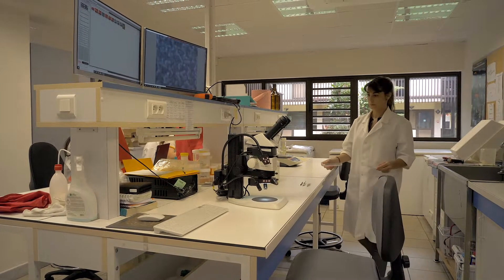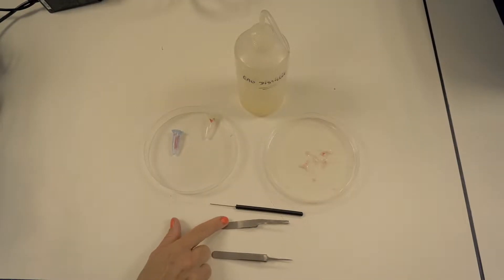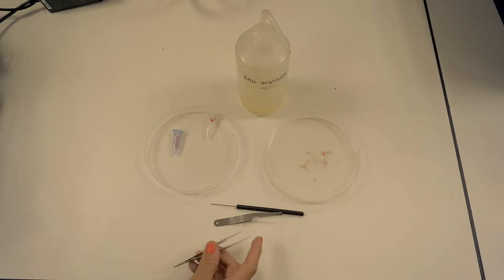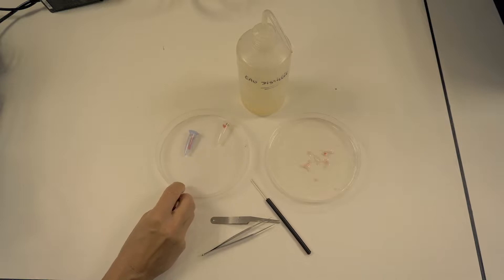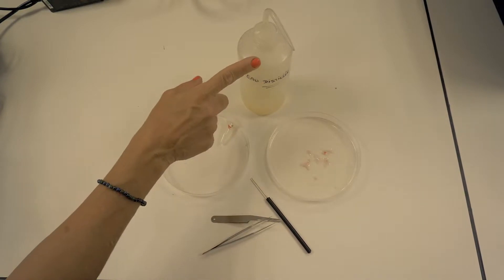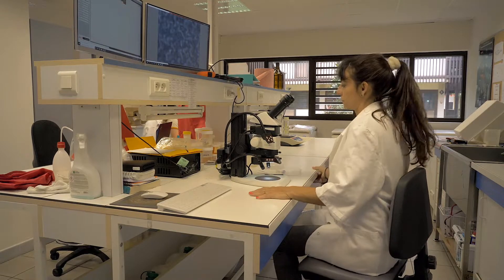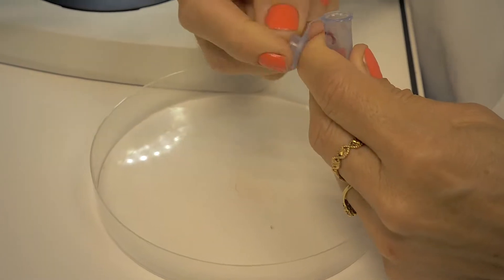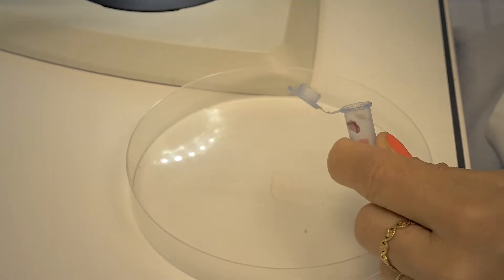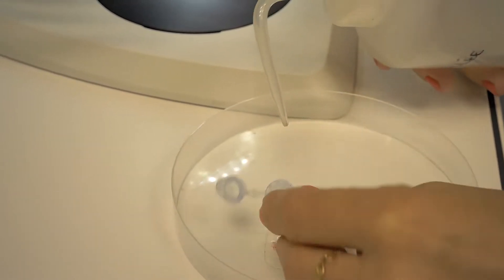In the lab, to remove the otoliths from the membrane, you need soft tweezers, thin and pointy tweezers, a needle, a petri dish, a pipette with water, and a microscope. I'll prepare the setting of my microscope. I remove the otolith capsule from the vial using the pressure of the water created by the pipette, and drop it inside the petri dish.